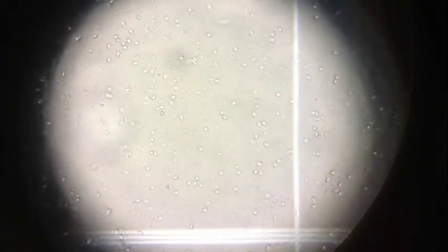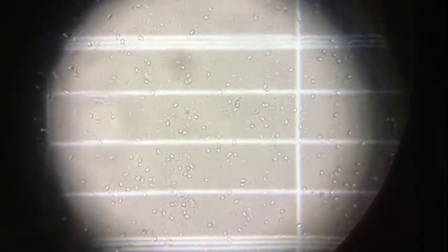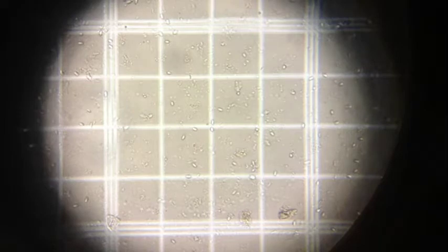Once your sample is in focus, move the slide around to find a set of guidelines. We want to find where the horizontal and vertical guidelines cross each other. Since we found the horizontal guidelines first, we will move left and right to find the vertical ones. We located the upper right-hand corner of the crosshatching grid. Count the total number of Nosema spores within this cornered square that's outlined by triple-lined grid marks.